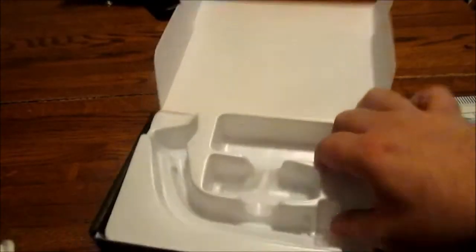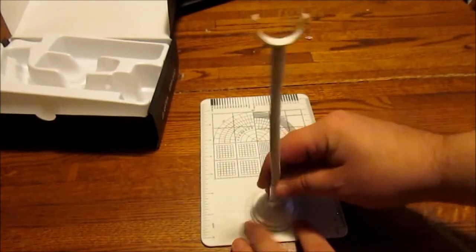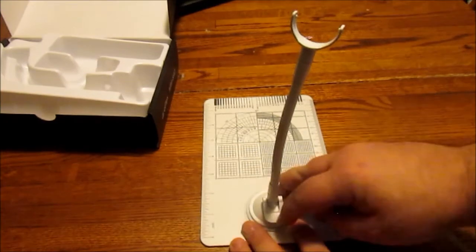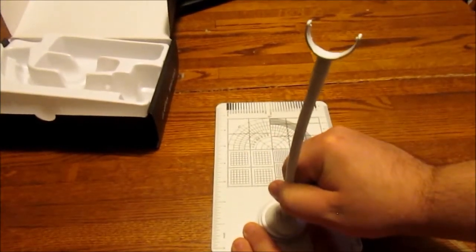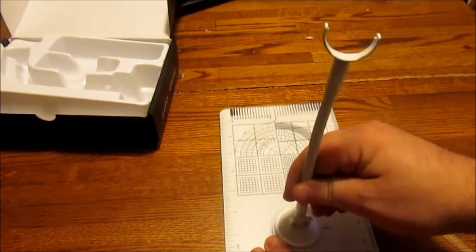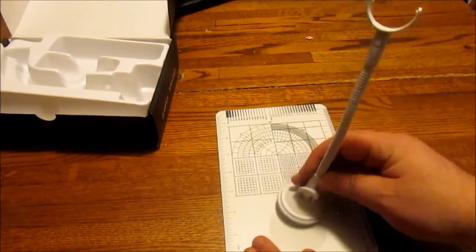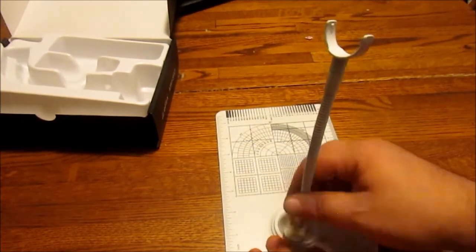All right, let's see how the suction cup works. That is really on there — that's pretty good. You can lift it up and it's still holding. You have to use the little release tab to get it off — that works really, really well. I'm actually really surprised at how rigid it is once it's attached. That's really good.